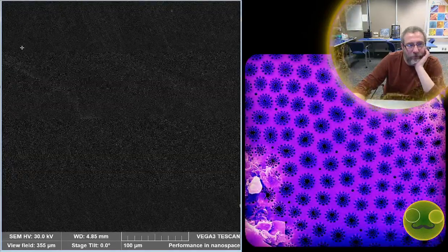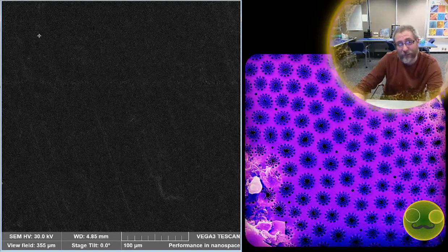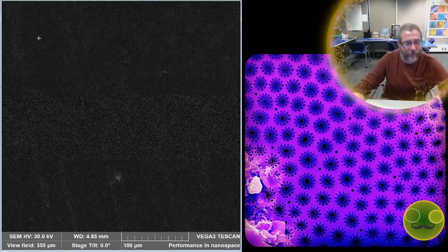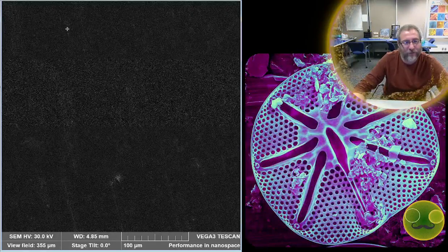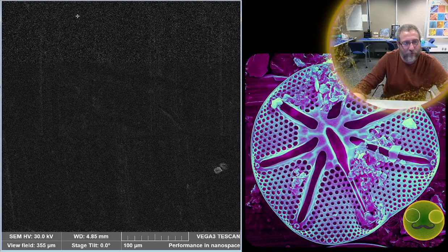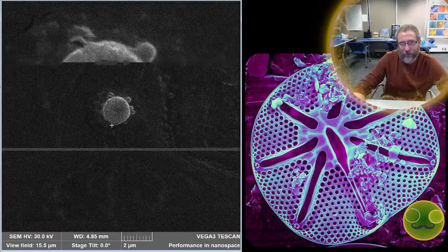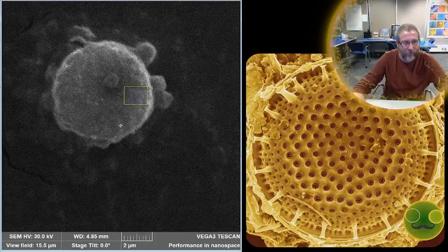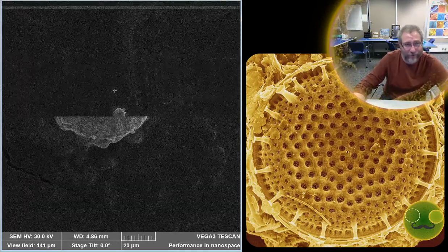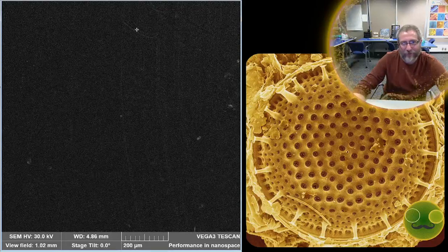But I do think that one of the things that's nice about the scanning electron microscope and diatoms in it is that you can get to see their characteristic structures and features. And while I think they are visually appealing in a light microscope, I think they're much, much more appealing, more charismatic, basically, for most of them in the scanning electron microscope, because you can see all this spectacular detail that's present at this very, very small scale. We're looking at them at 20, 30,000 times magnification, and the detail of some of the structures that you can see at that magnification is kind of crazy with the scanning electron microscope. So I think that's part of the appeal, probably, for people.